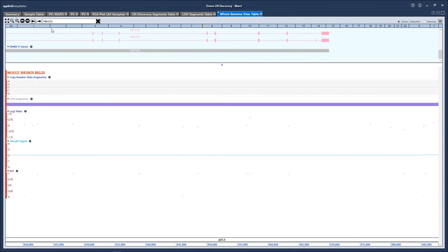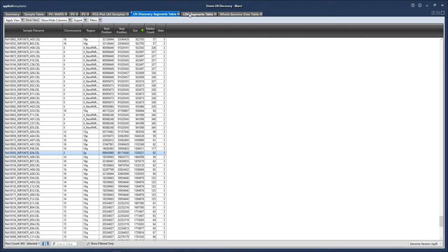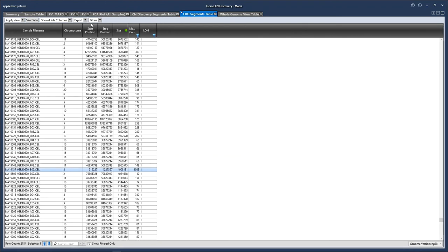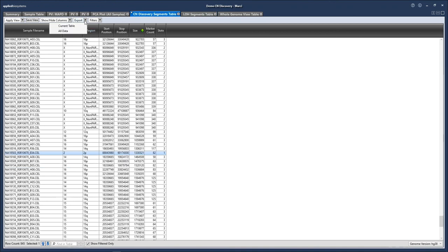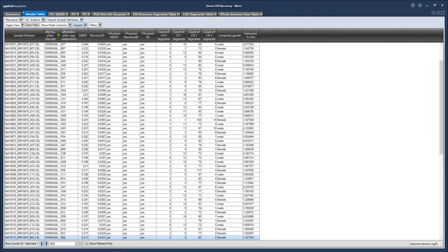Now that we've gone over the basics of using the whole genome view, let's also go through exporting options. In either the segments table or the LOH table, we have options to export with the current filters applied by choosing current table, or we can choose to export the entire table. From the sample table, we also have exporting options for the copy number data — you can choose to export in IGV, Nexus, or VCF format.